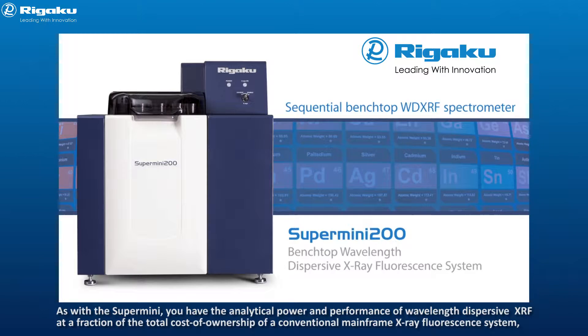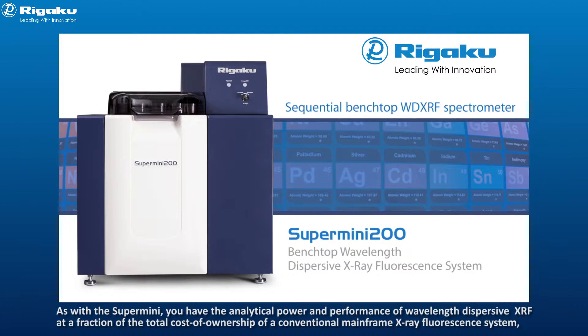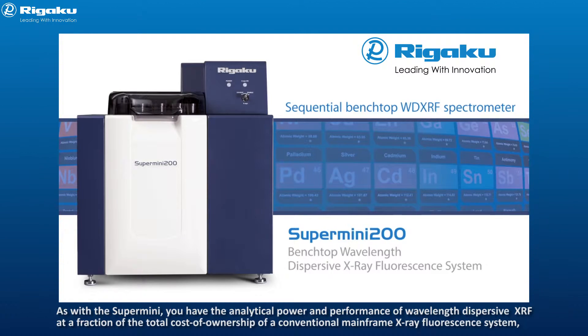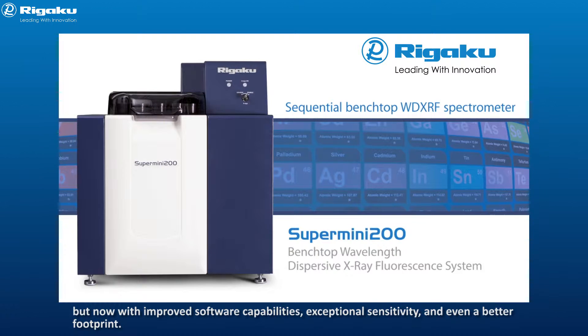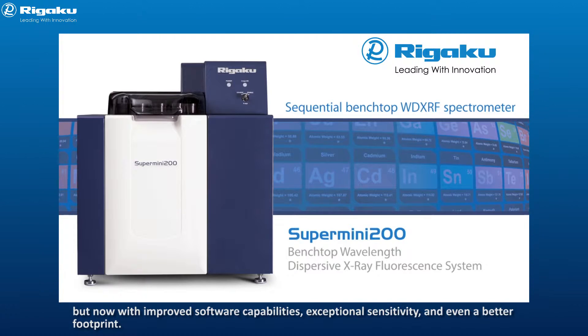As with the Supermini, you have the analytical power and performance of wavelength dispersive XRF at a fraction of the total cost of ownership of a conventional mainframe X-ray fluorescence system, but now with improved software capabilities, exceptional sensitivity, and an even better footprint.